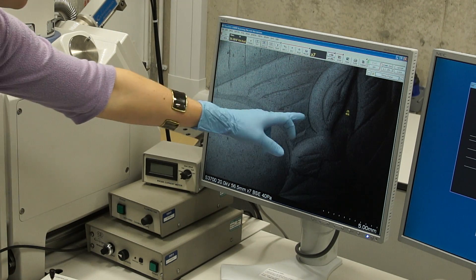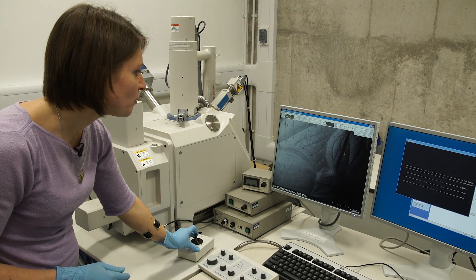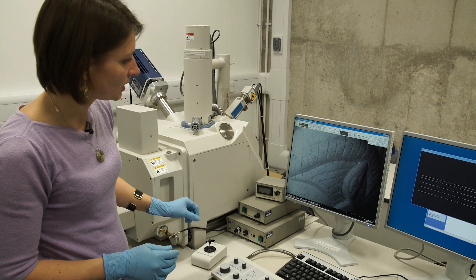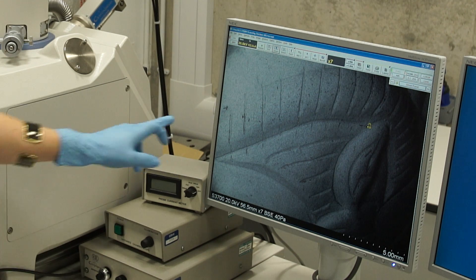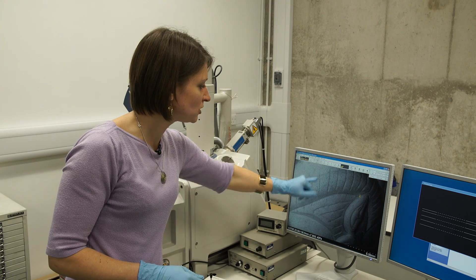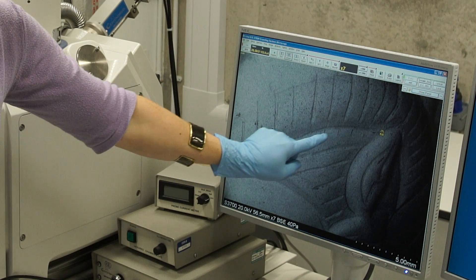This is an ear of one of the boars. Those long grooves are part of its mane, and this is the mane going through here. What we are trying to look at is the type of tool marks that we can see on the images. Here, for example, we can see cuts which have been done in the mane, but the tool has actually gone further down. They're quite sharp-angled.